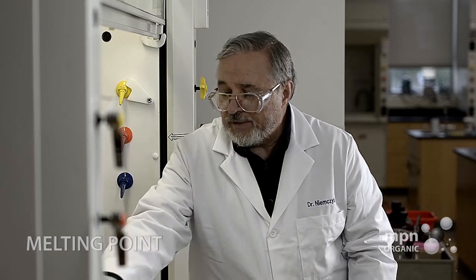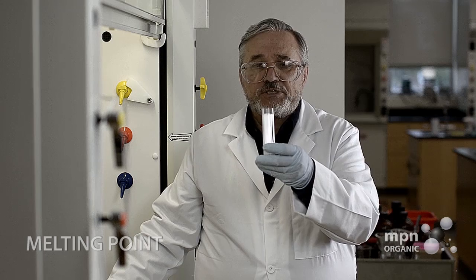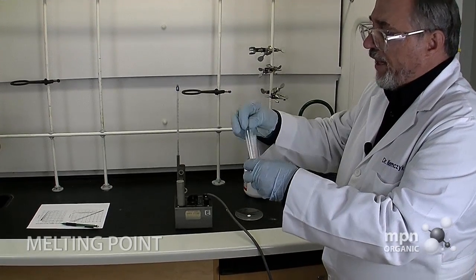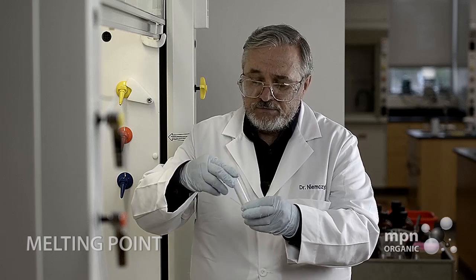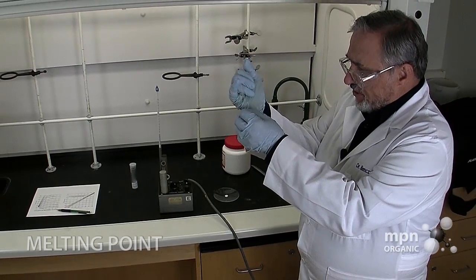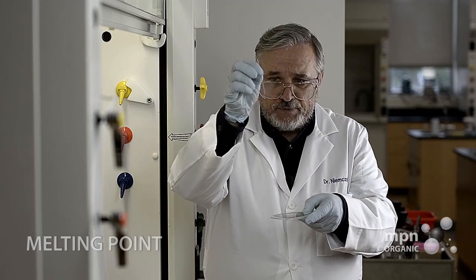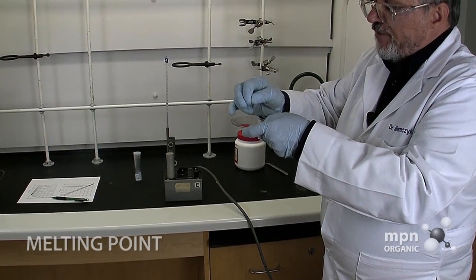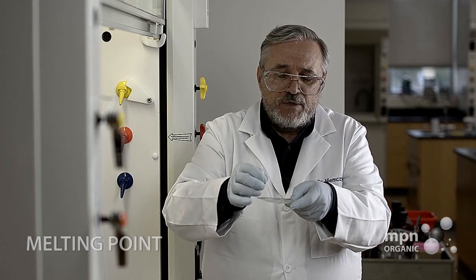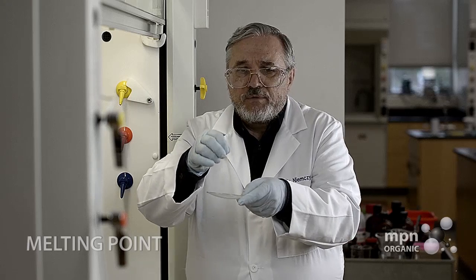Okay. And now we have to fill up a melting point tube, which we will find in various places around the lab. This has 100 little melting point capillaries. I'll take one out, and all these capillaries are just very thin glass tubes, which have a sealed end in it. I've got this turned upside down, the sealed end up, because I want to take the capillary and push it down into the solid that I have on the watch glass here. And I push it in several times, and I can get maybe 3-4 millimeters column of solid in here.